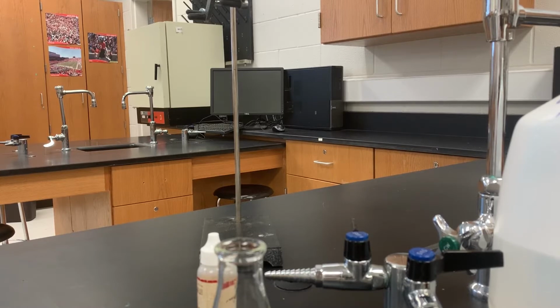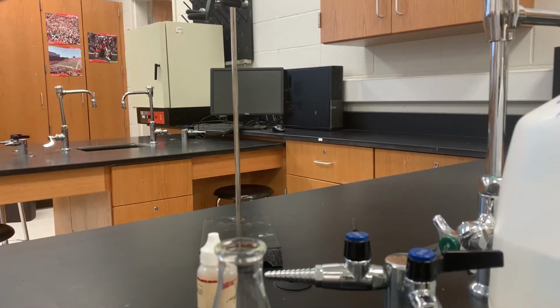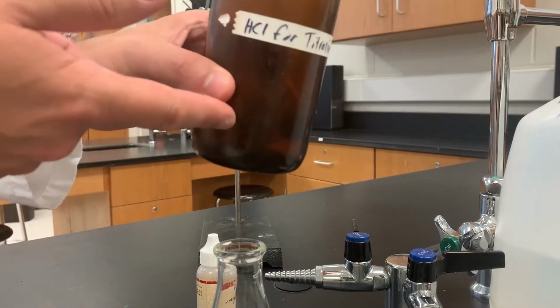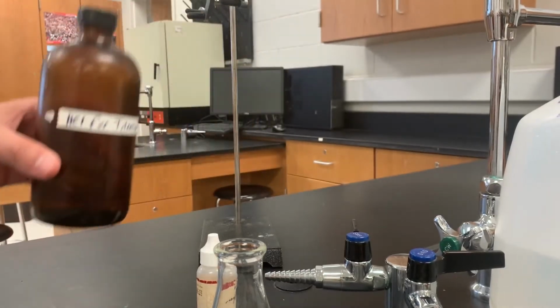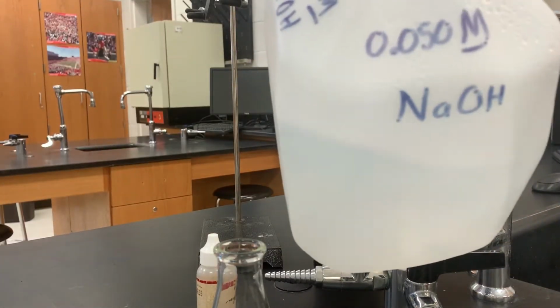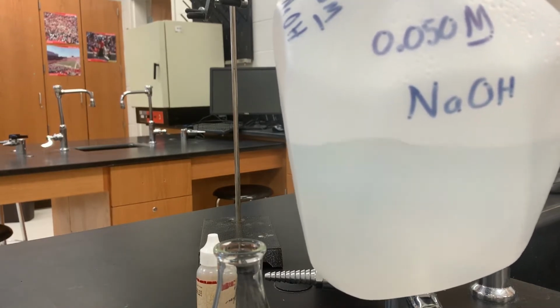All right, for today's experiment, I'm going to explain how to do what's called a titration. The purpose of this experiment is that I've got this hydrochloric acid, and I don't know what the molarity of this acid is. So I'm going to try to figure that out using this 0.050 molarity sodium hydroxide solution.